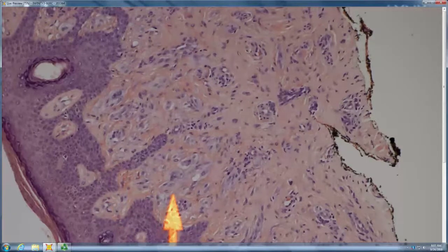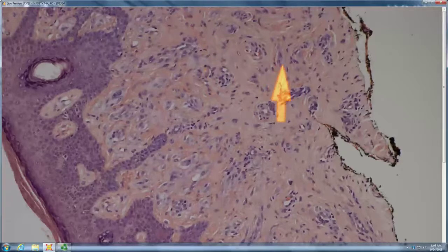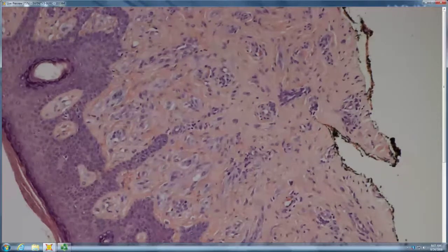They're large grayish cells. They have vesicular nuclei. They have a single nucleolus. They disperse with depth. They're large, spindle and epithelioid. They have a vertical orientation, like they're raining down. Spitz almost? It's an intradermal Spitz. Oh, okay. Very good.